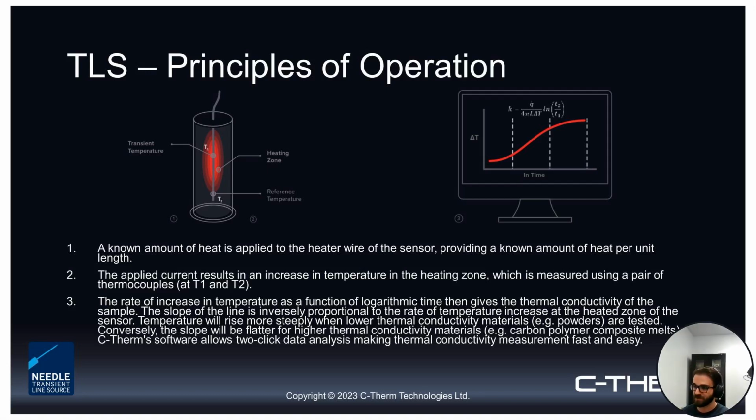But again, at the end of the day, once you set things up, you start running, collecting your data, you'll see something like you've seen similar, that delta T as a function of time, which is collected within the software. And again, there's a little bit of a manual data adjustment process that you have to run through to go through and validate those results.